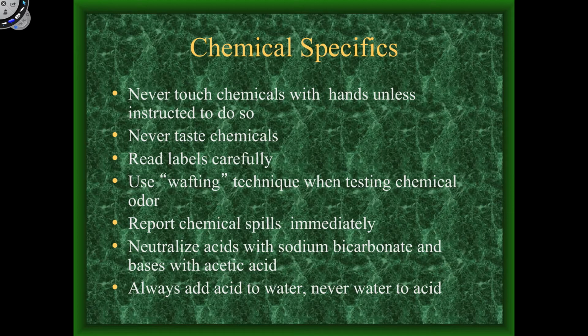Never touch chemicals with hands, unless instructed to do so. There's very rarely a time, in fact I can't really think of a time, where you're actually going to touch a chemical with your hands. There's really no lab that's going to require that. So when I say don't touch the chemicals, that should be common sense.